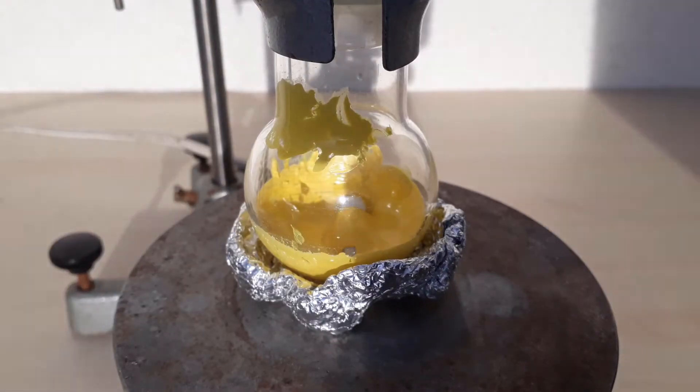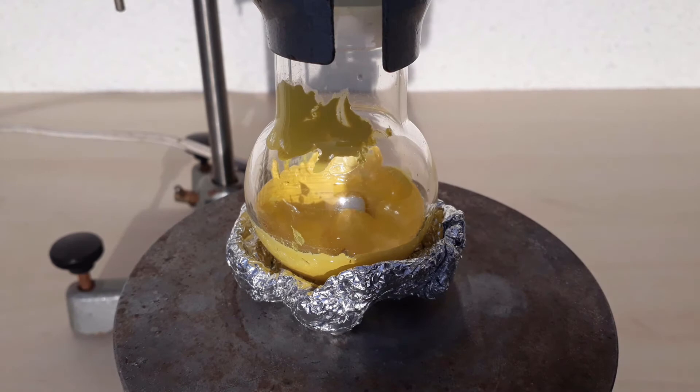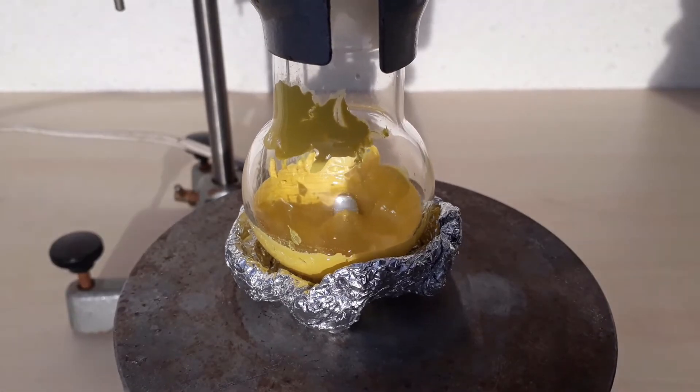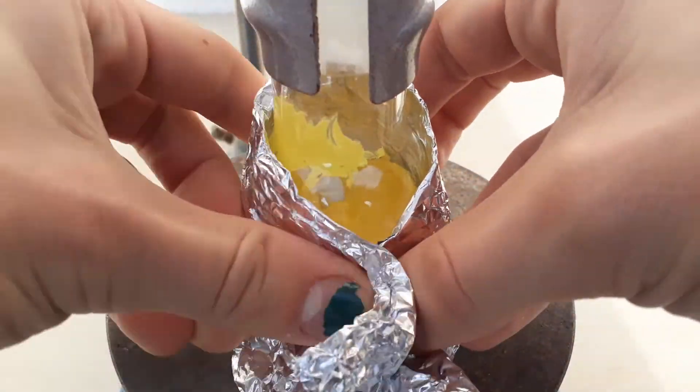Coming back the next day, I saw that the colour of the reaction mix was yellow again. This first led me to believe that, despite the fact I knew the end product was yellow, the reaction didn't go to completion yet. So I set it up to be heated again.